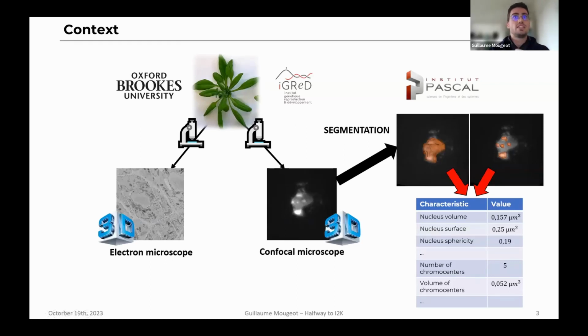Basically, what biologists are looking for is extracting significant measurable information, such as volume, surfaces, etc. And of course, some of you might already know that one required step to do that is segmentation, which consists in extracting, coloring, and labeling the regions of the image you captured.